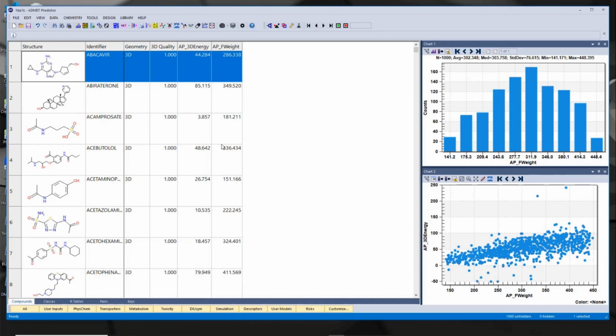You can then take one or more 3D query conformers and quickly screen that conformer database to find similar structures. Those similar structures would then be worth considering for purchase and follow-up in vitro testing.